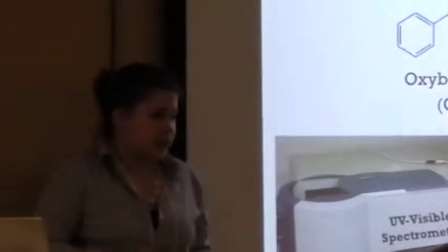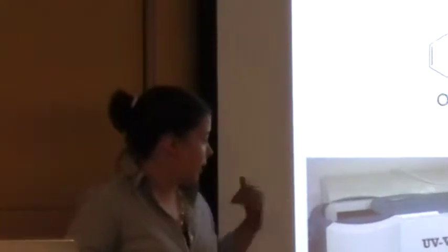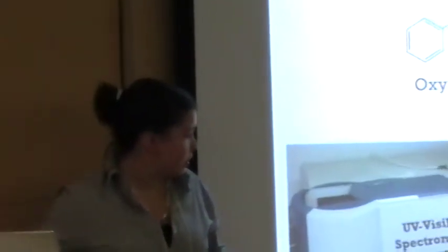So here are the benzophenones and the acidic protons that we're testing their bond strength. And because they are UV absorbers, we put them in the UV spectrometer. It measures how much light these molecules absorb. It shines a light through and says this is how much light you absorb. But light isn't just a mass, it's broken up into different wavelengths, so there's discrete amounts of absorbance depending on the wavelength. And we can understand each spectrum by the concentration because of Beer's law: absorbance is proportional to the concentration of stuff you put in it.